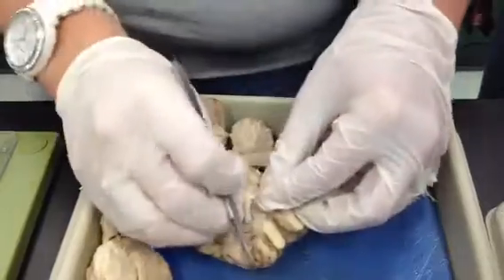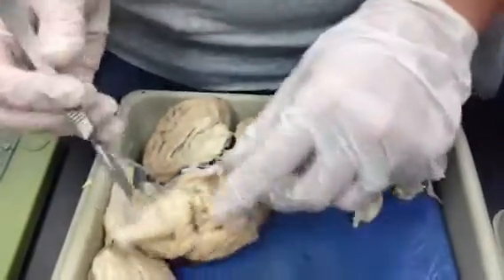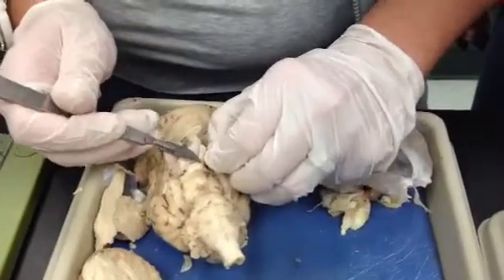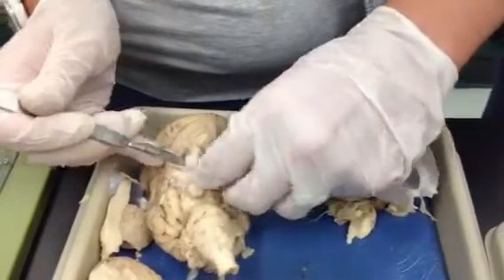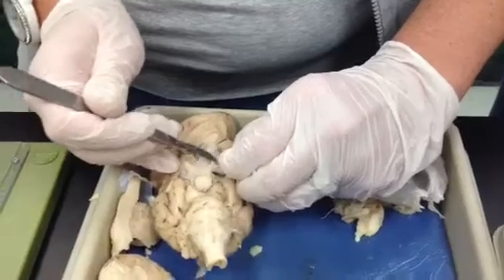Okay, so this, see here? Optic chiasma. That's what it looks like. That really does look good. It does look good. I mean, when you see it actually, it's unmistakable. So we'll use this one for the practical because I've been so meticulous here.